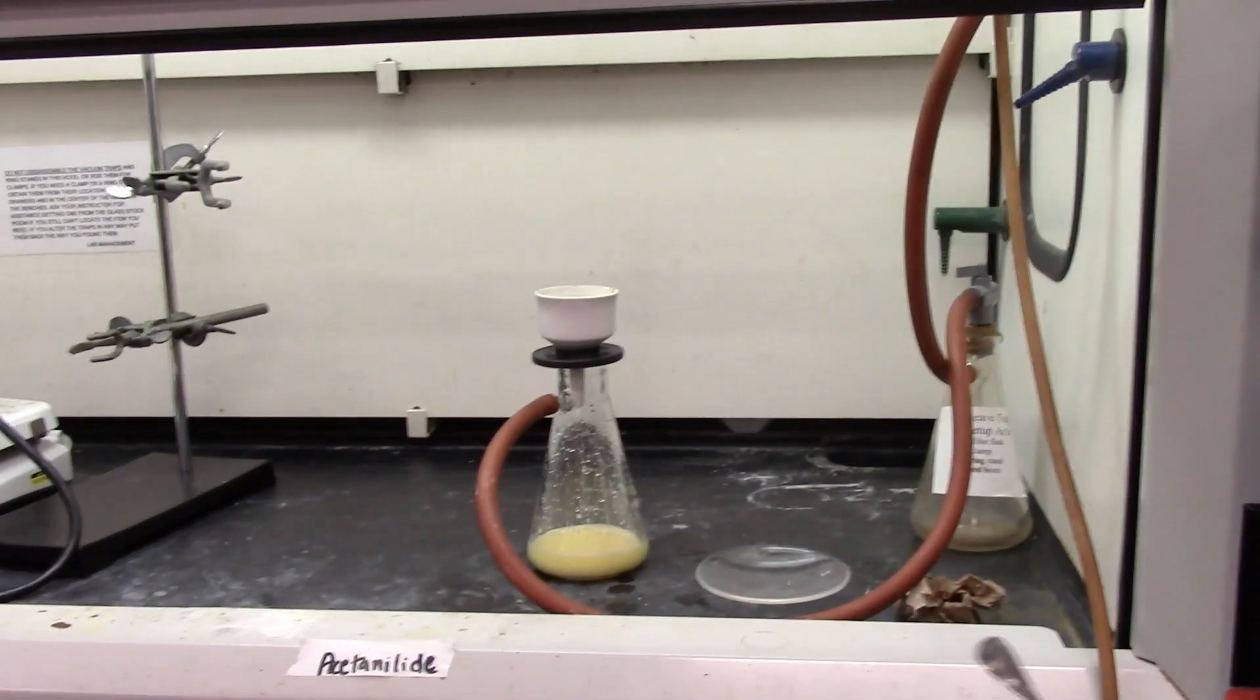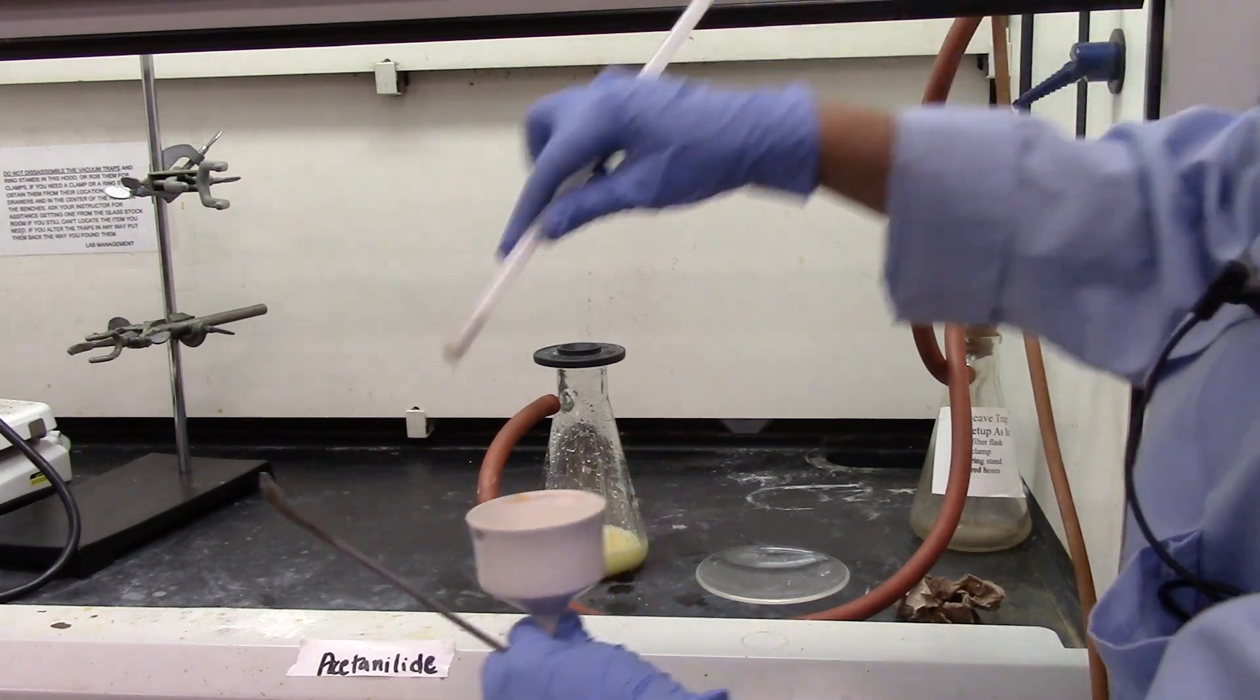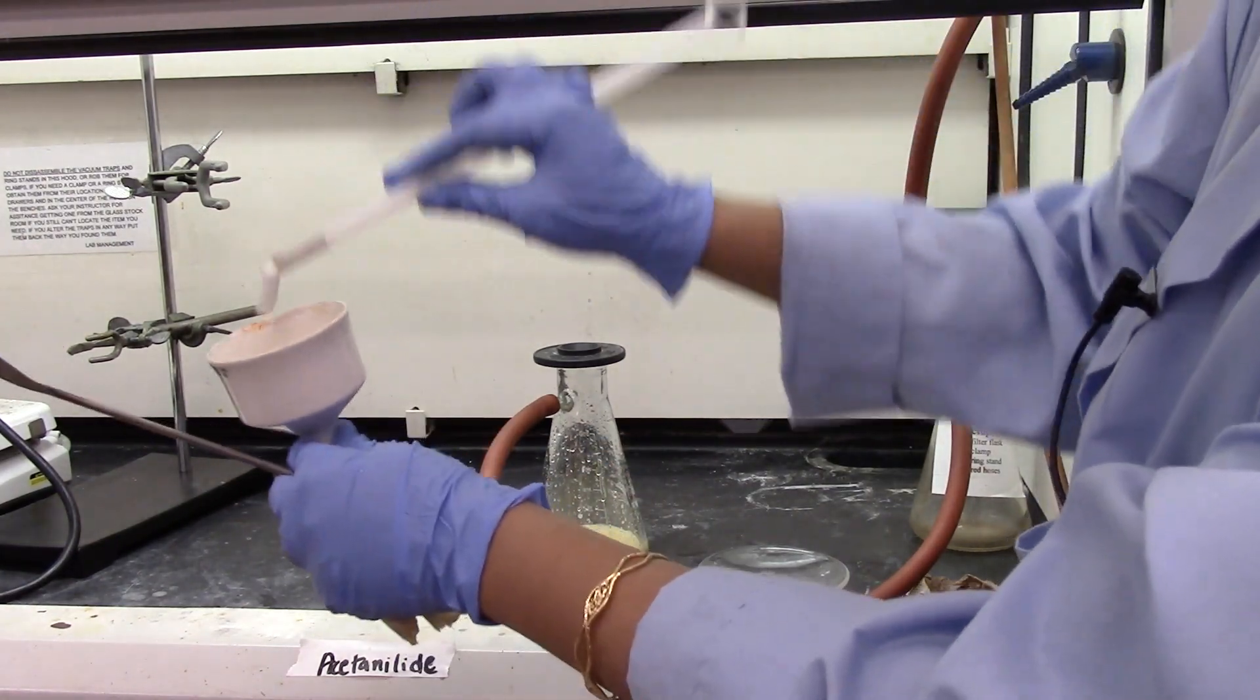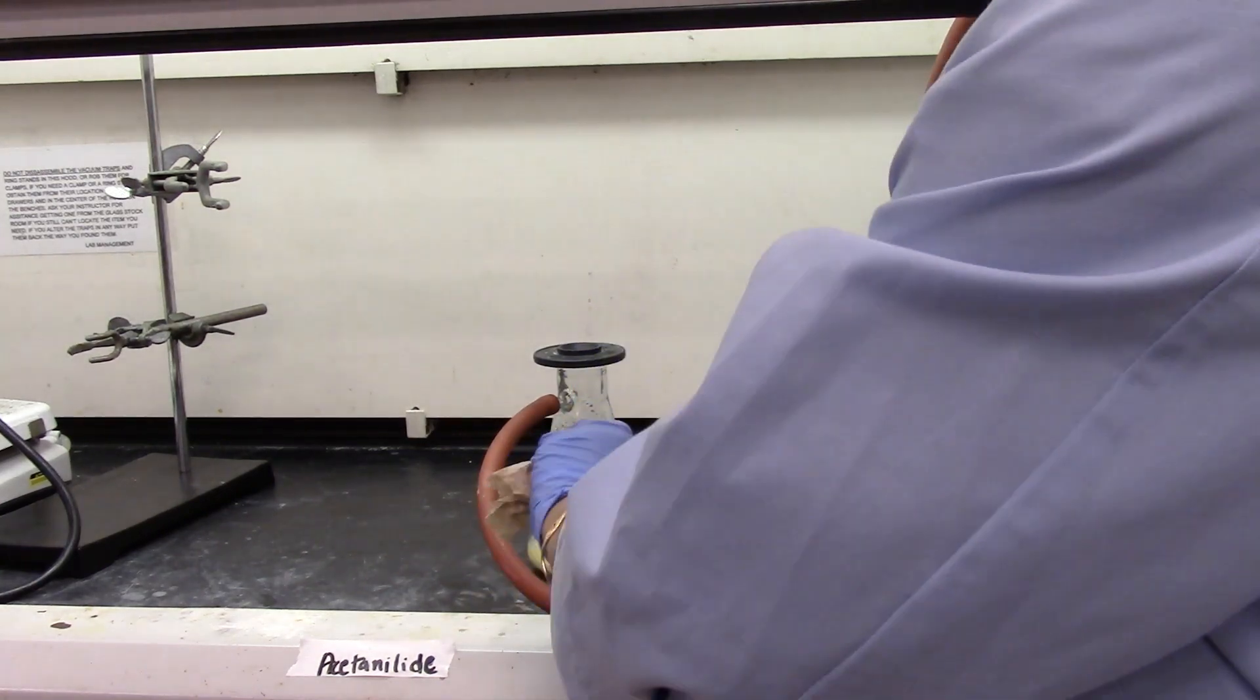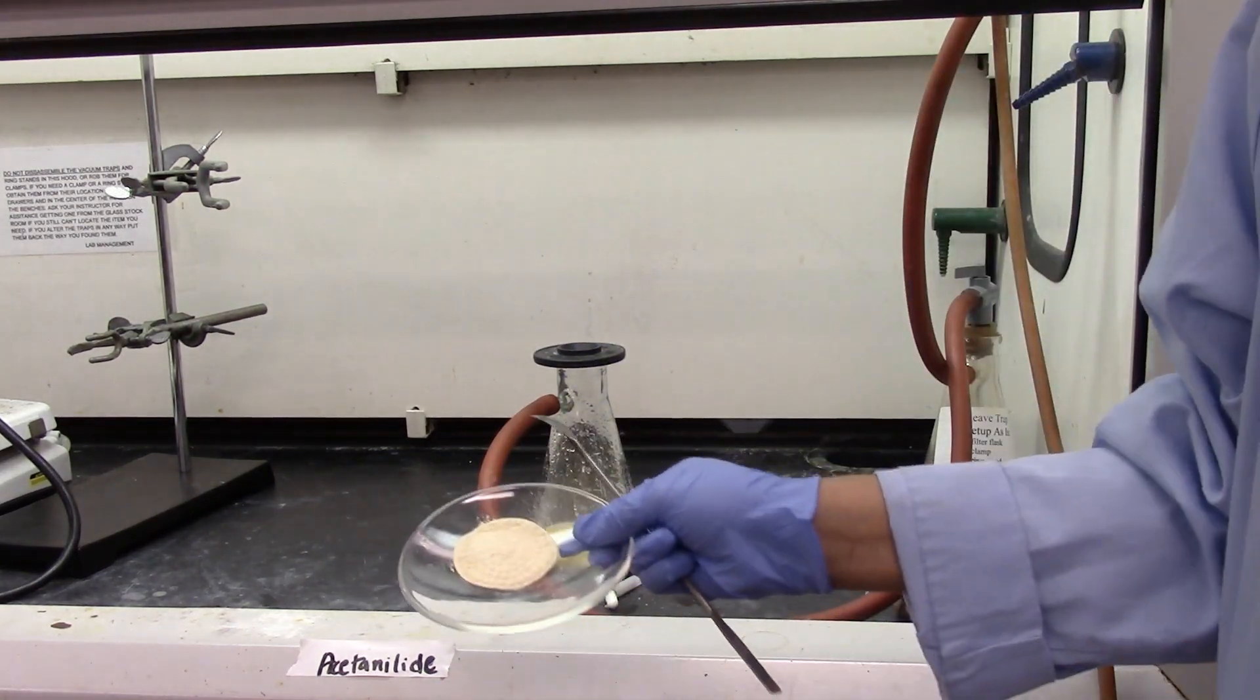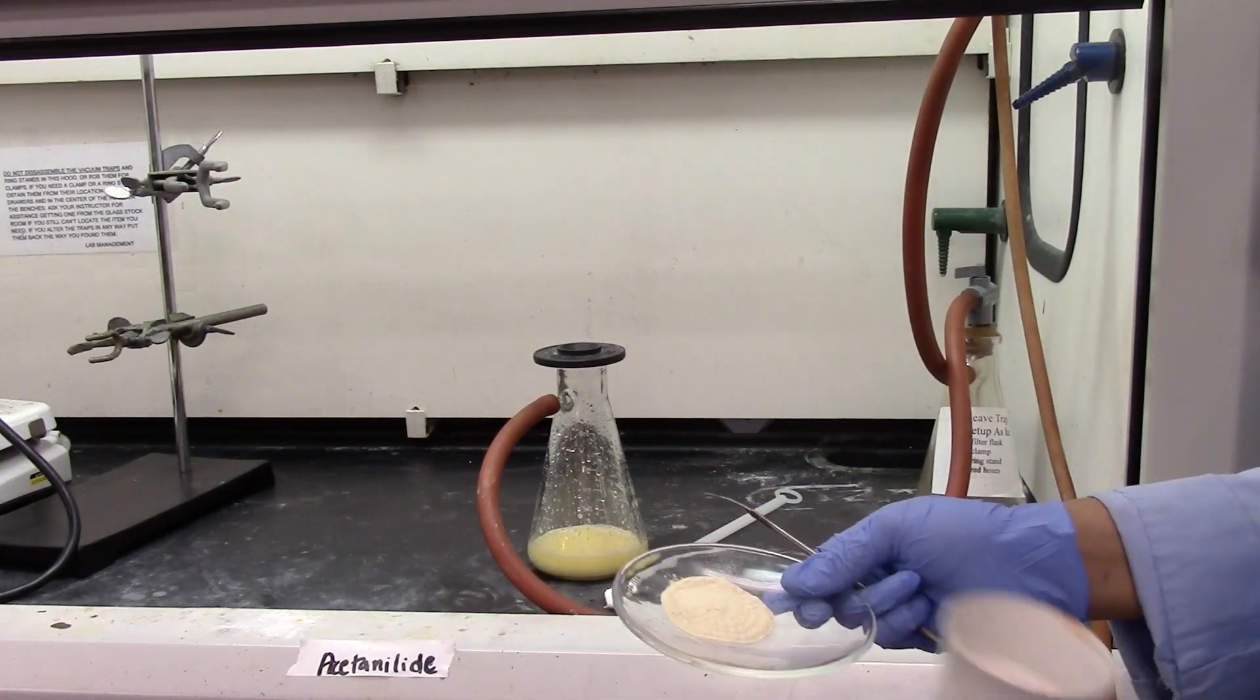The product looks pale yellow. I'm going to add about 5 ml of DI water on the top. Turn on the vacuum. That's the acetanilide product sitting in the vacuum. I'm going to turn off the vacuum and scoop the product onto the watch glass. I do have my stir bar. I'm going to take it out with a magnetic retriever.